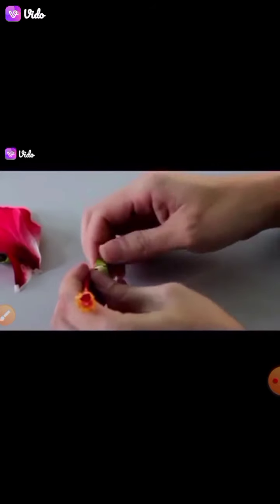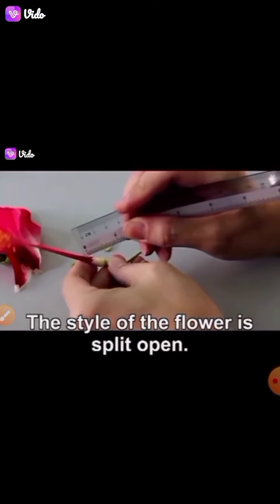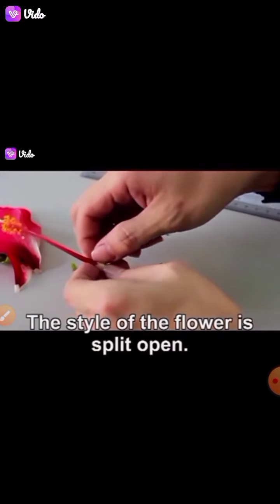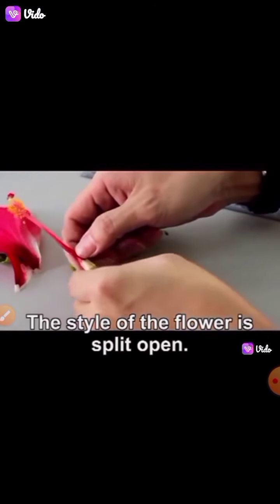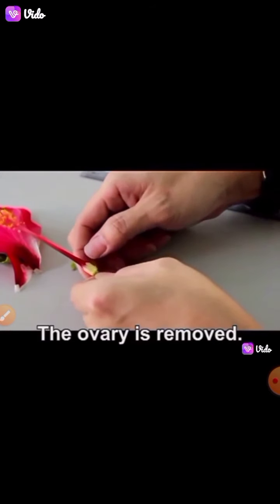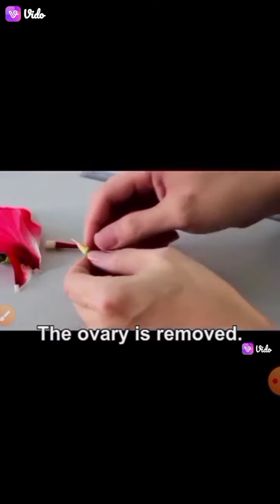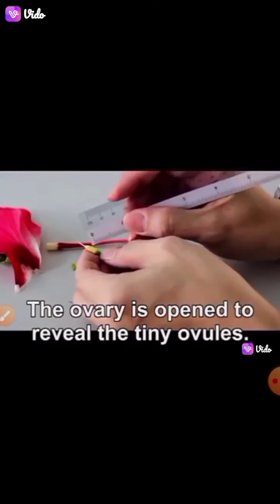After this, we slit the posterior end, and the style of the flower is split open. Very slowly, a very thin layer of the style we remove, very carefully, slowly. Okay, yes, open the style, and now we get to see the ovary, and we remove the ovary very carefully.